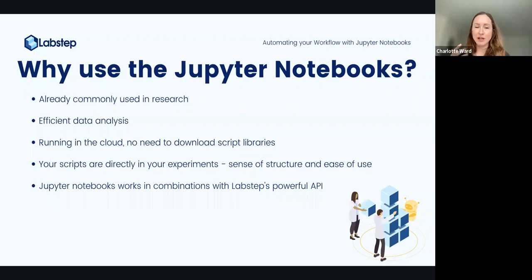So if you imagine trying to collaborate with someone without the added benefits of a cloud ecosystem, you might have a load of data that you're trying to analyze, and you might be working with a bioinformatician to do the analysis on this, and you might be passing things back and forth between each other, data sets and different versions of scripts, and you'll be having things piling up in your inbox where you're trying to work collaboratively on something, and somehow you have to keep track of what's the latest version and download everything onto your computer.